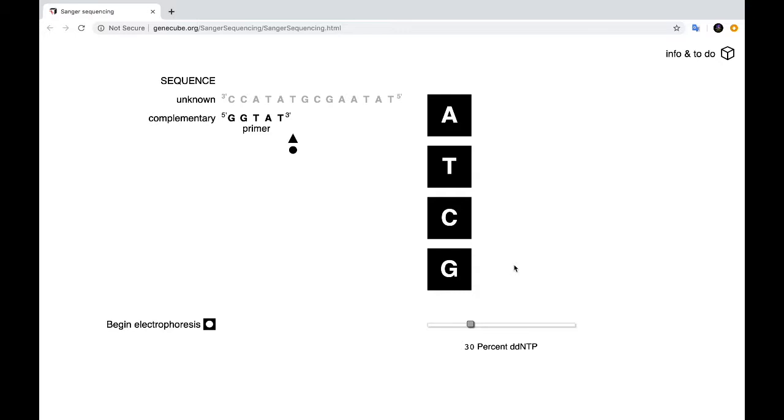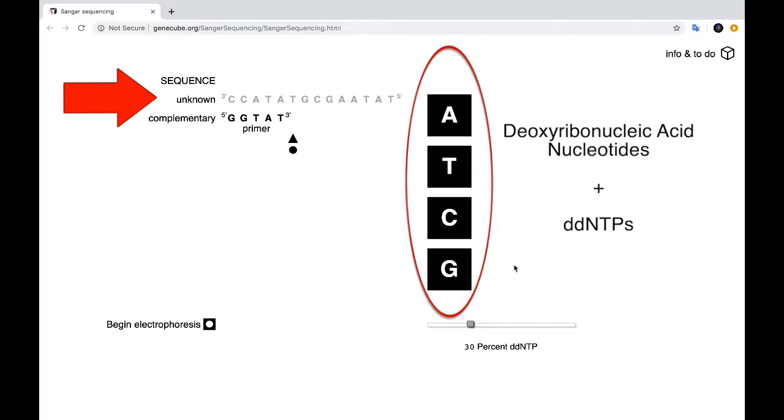So essentially, you're going to mix it all together, the unknown piece of DNA, the deoxyribonucleotides and the DDNTPs. And at the bottom, you have a slider for the percentage of DDNTP you wish to use.